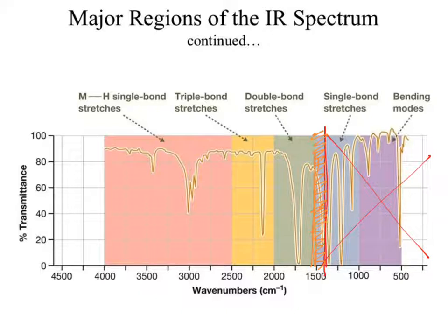If you zero in on every single little peak that you see, you're now overanalyzing it and you run the risk of getting false interpretations out of it. What IR should be is insanely fast. Sub 5 seconds, at most. How do you pick up that speed with recognizing? Practice. Exposure to lots of IR. That's why you have to look at more and more spectra.